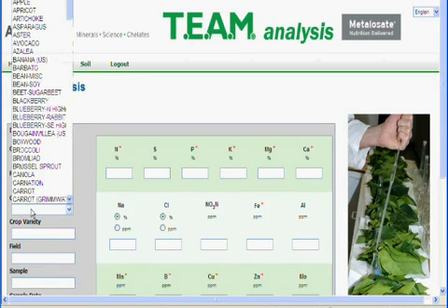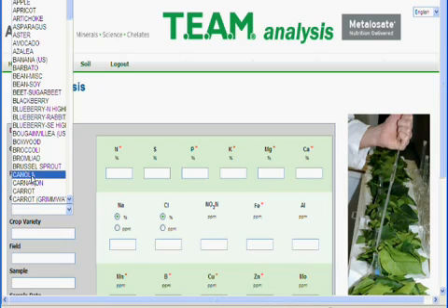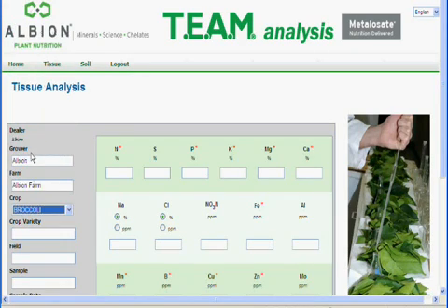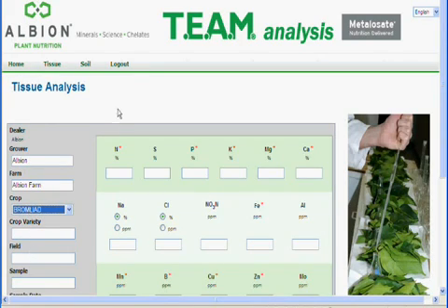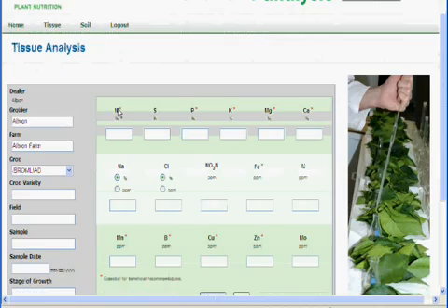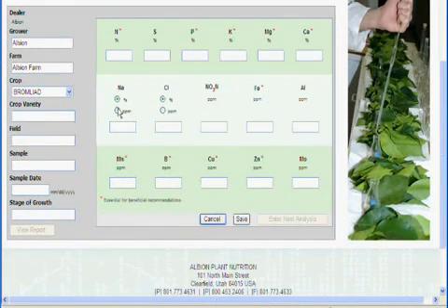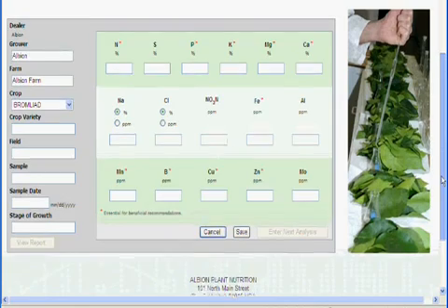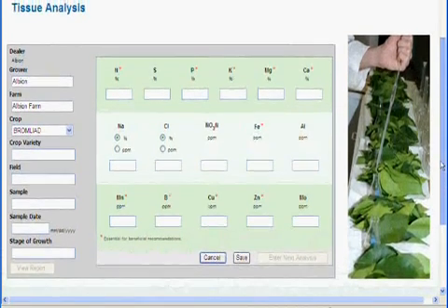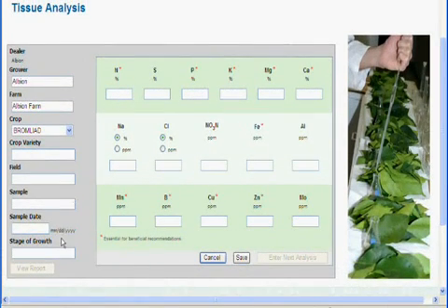Continue by selecting your crop, your crop variety if needed, field, sample, sample date, and stage of growth. Remember to enter the date in the correct format as demonstrated here.